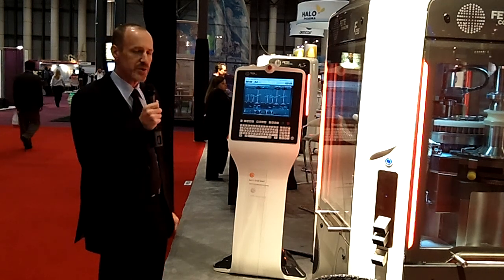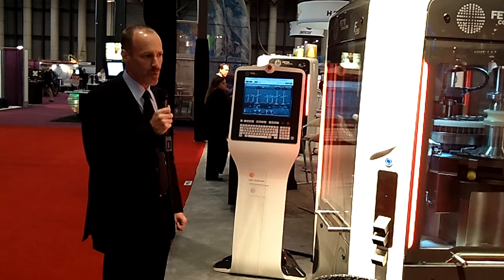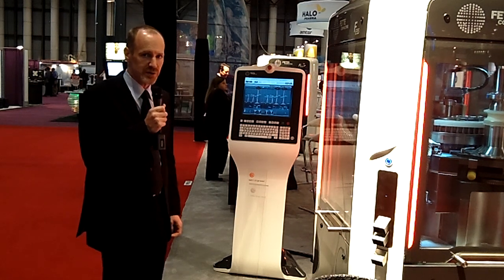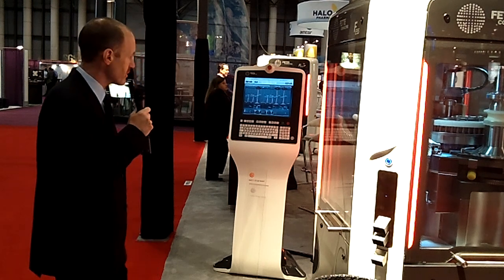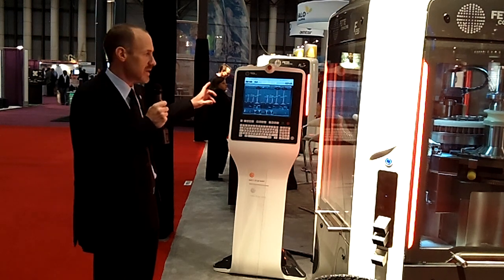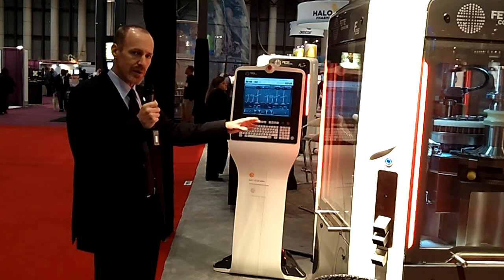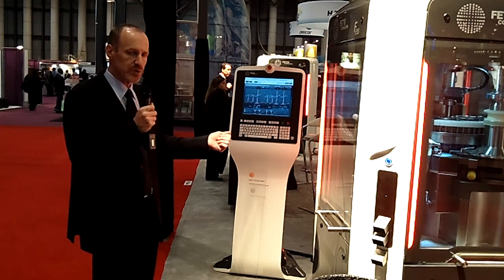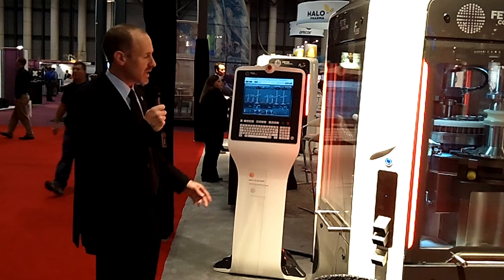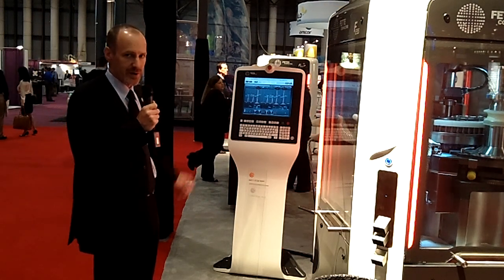The operating platform for the machine is Windows 7 embedded. We authenticate through WinLogon, taking advantage of the security features inherent in the Windows platform. For troubleshooting purposes, many of the mechanisms that a maintenance engineer might require access to — such as CPU status, digital I/O status, and safety PLC information — can be monitored and adjusted on the terminal in real time.